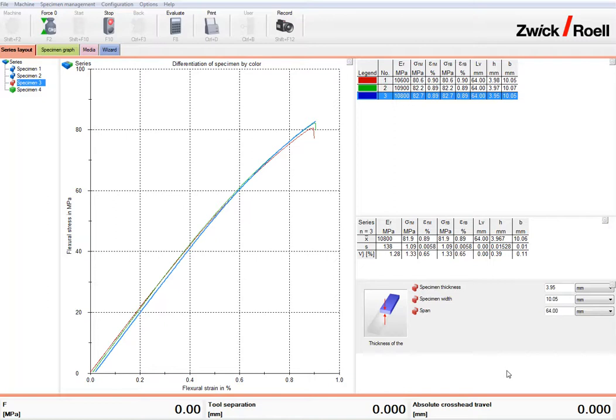Today I'm going to be showing you how to use export interfaces to export the raw data, to export the curve data. You can export the curve data into an ASCII format file called the curve, and the extension will be TRA file. This is the extension that TestXpert 2 uses. So I'm going to be showing you that.